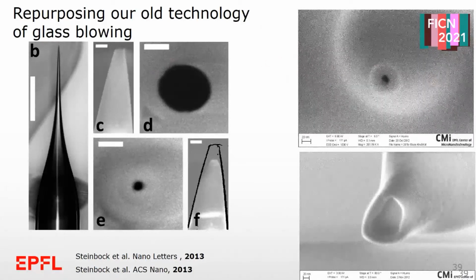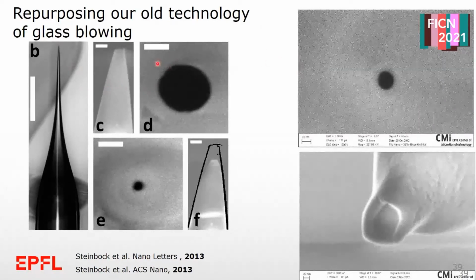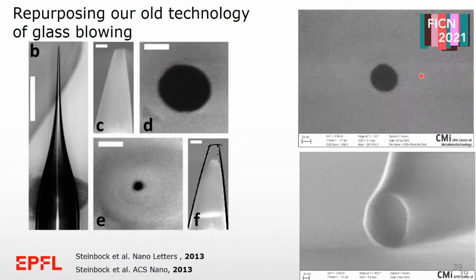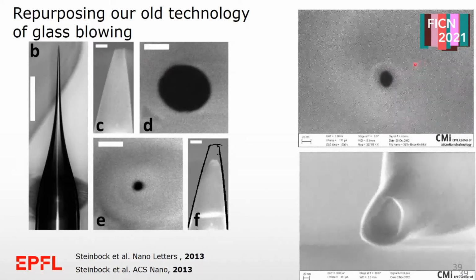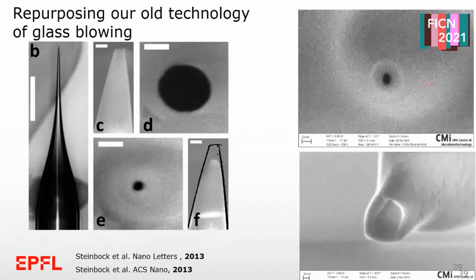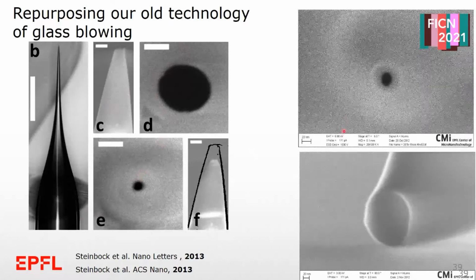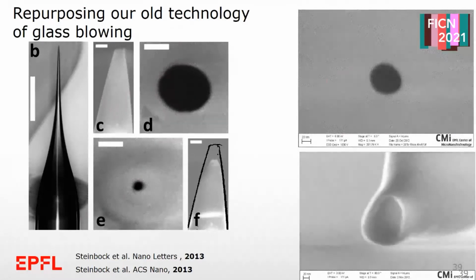In SEM, we can place very many capillaries and look at them one by one, and just by electron irradiation that hits the glass locally, we can shrink these pipettes that typically start from hundreds of nanometers down to 10 nanometers.